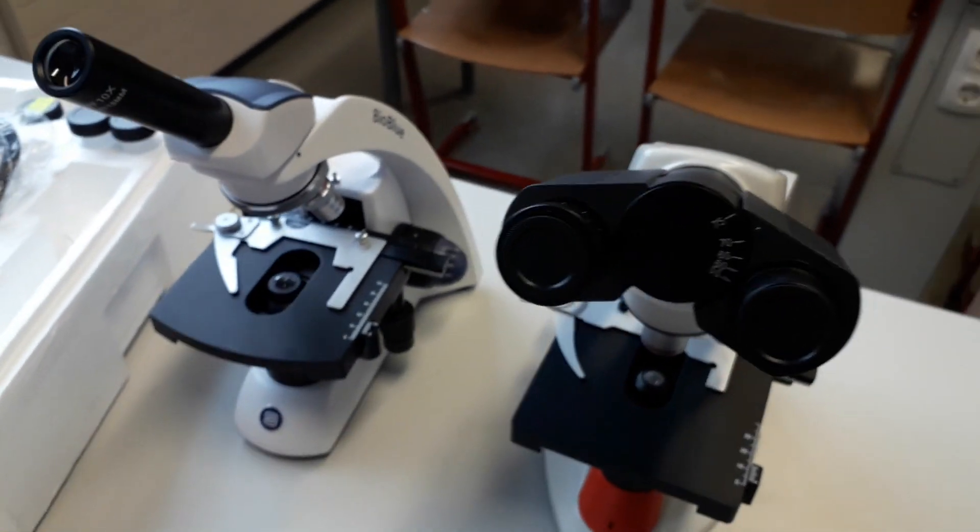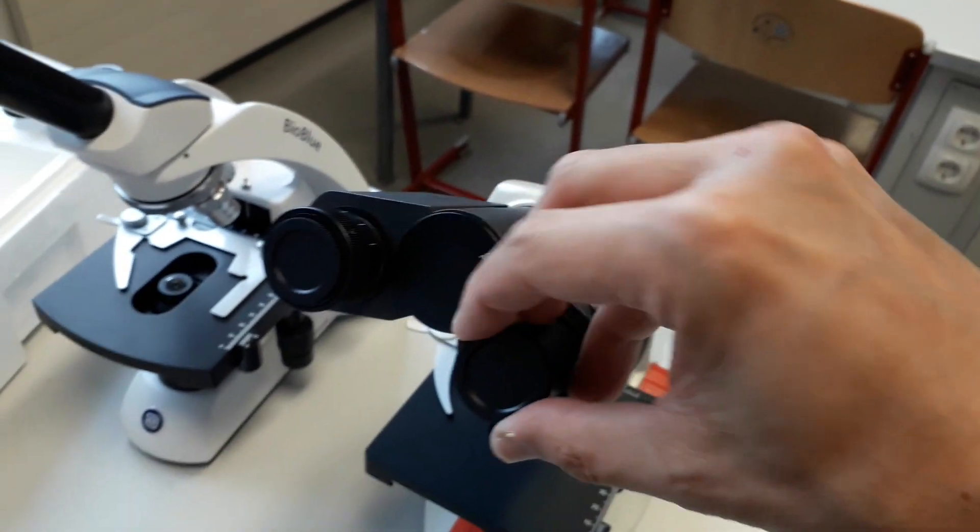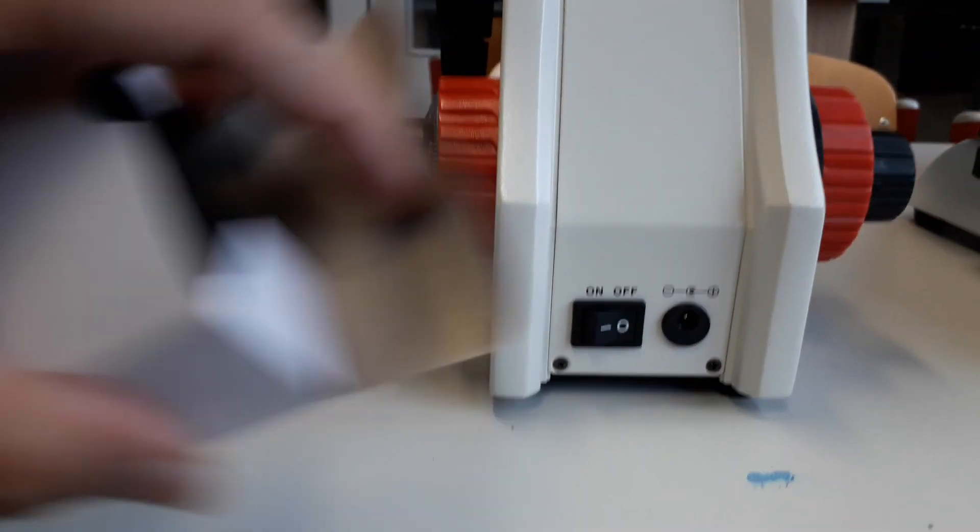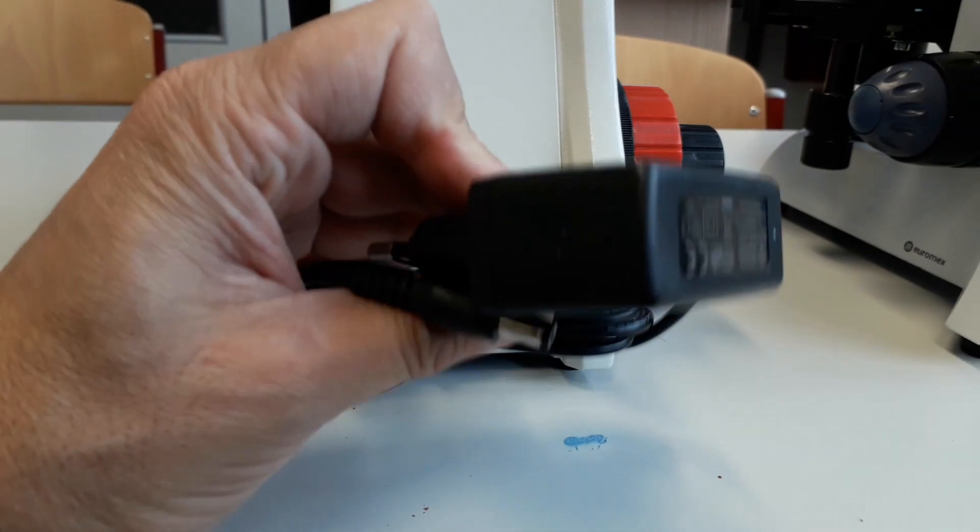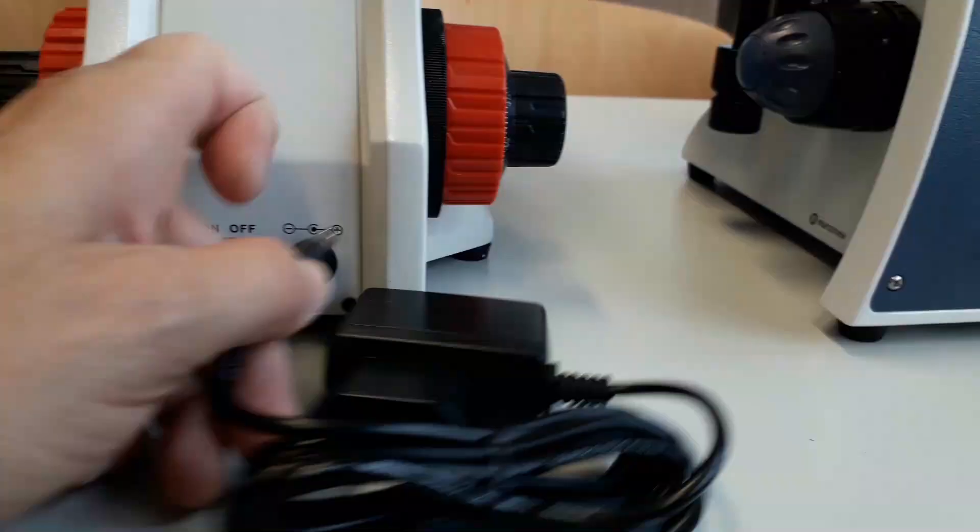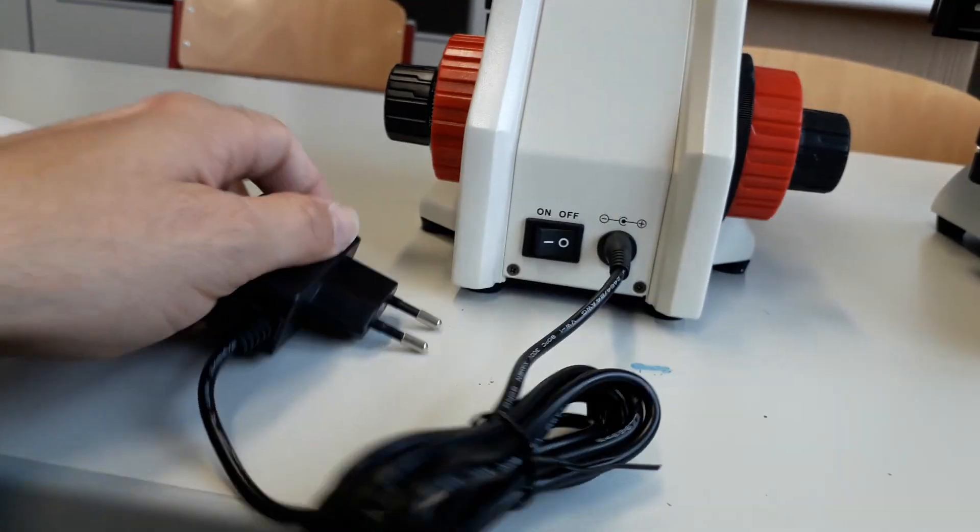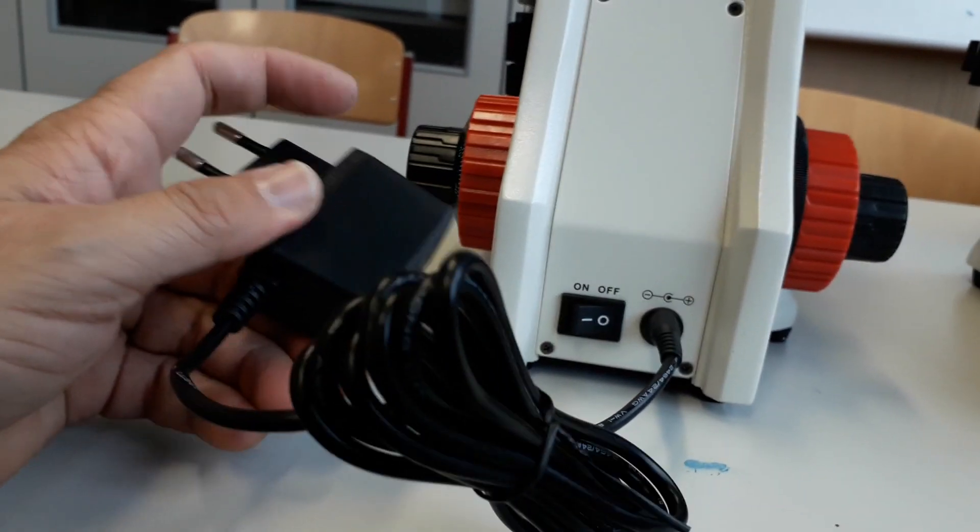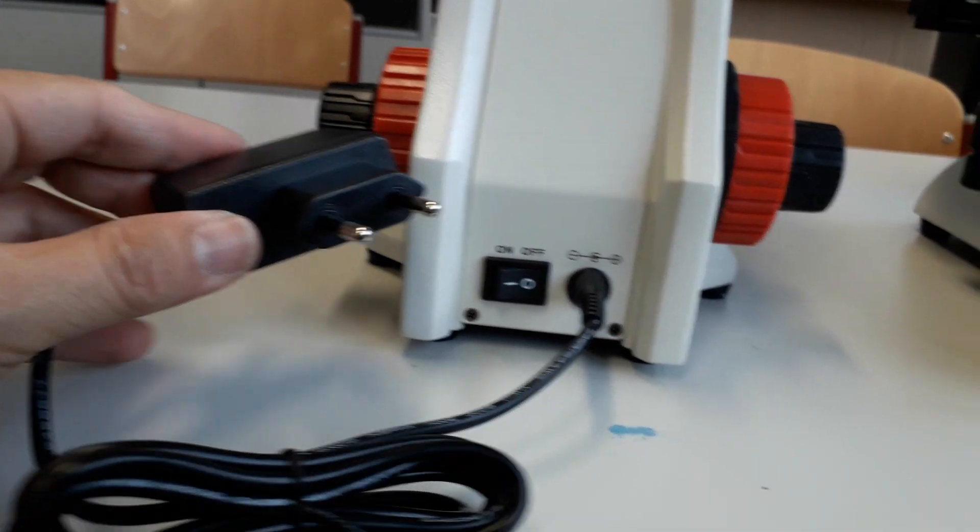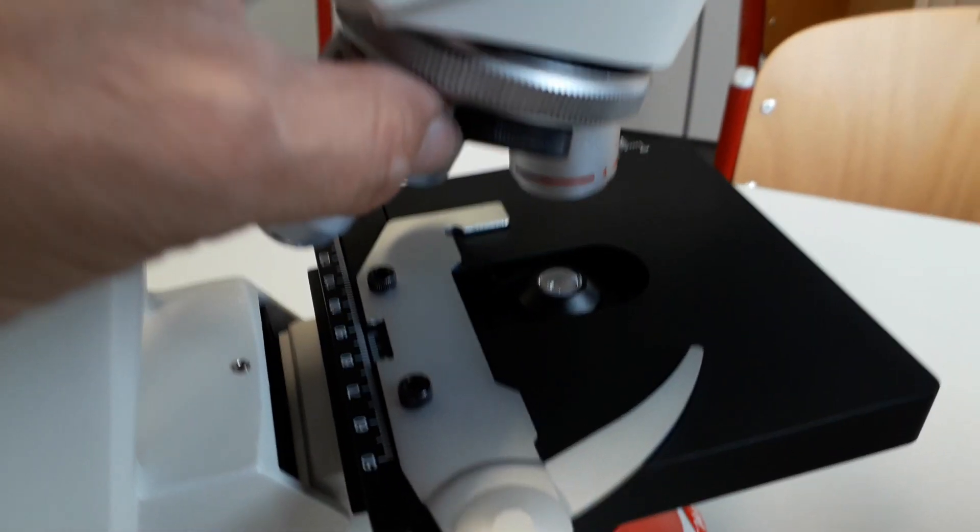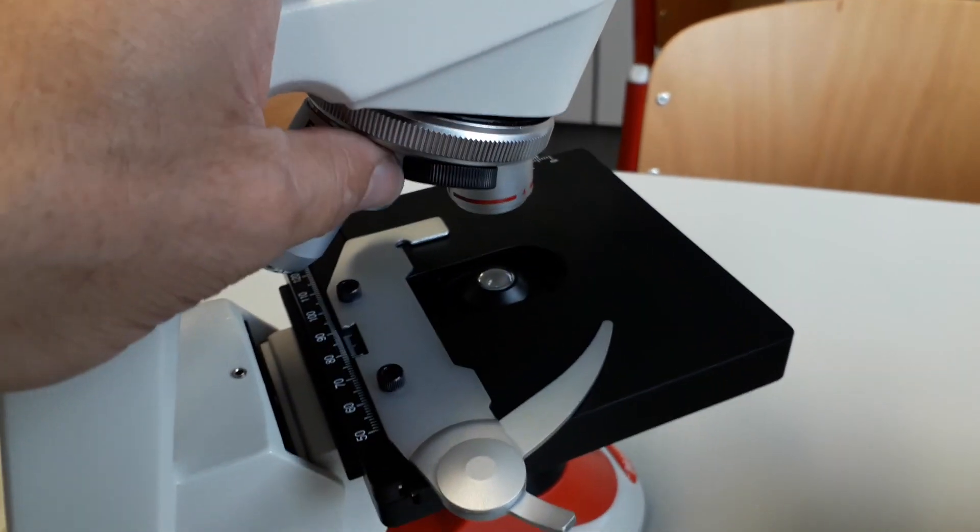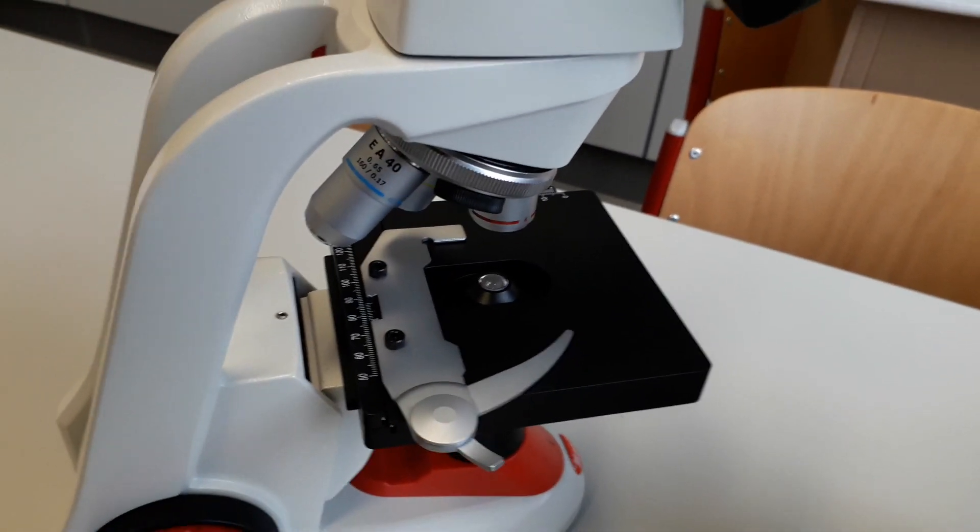This one here has three objectives. All the 160 millimeter DIN standard. You know this because it says the 160 over here. Let's put them next to each other. They look similar also from the outside. Again, we're going to get to the monocular version here. So what I have to do is I could take this out here and put the eyepiece in. This one here has an external adapter. An external power source. But honestly, it looks okay. It's not that big and heavy. It really doesn't make a difference. I mean, basically this one goes in here and then plugs in over here. Honestly, it's so small and light. It really doesn't make a difference of whether we actually have this or not, honestly.